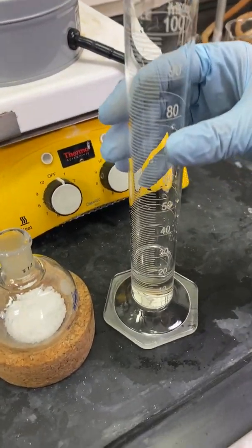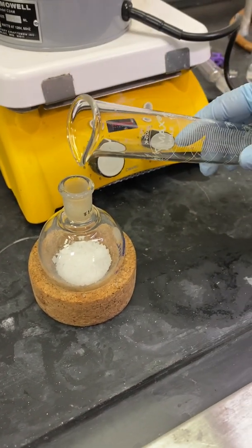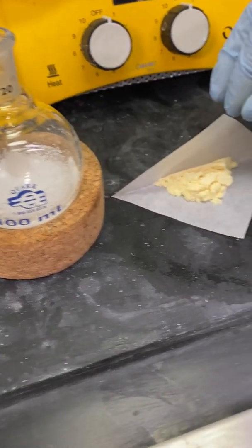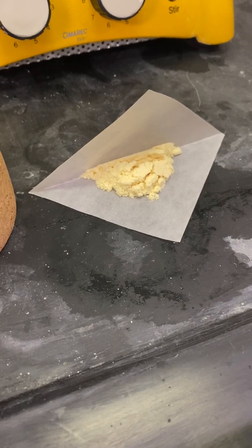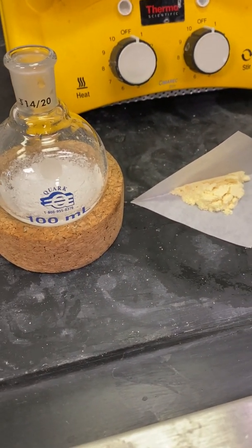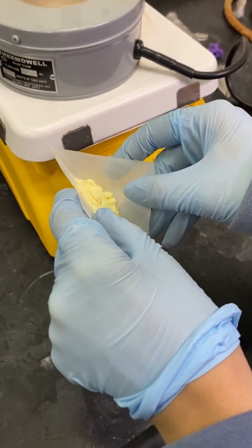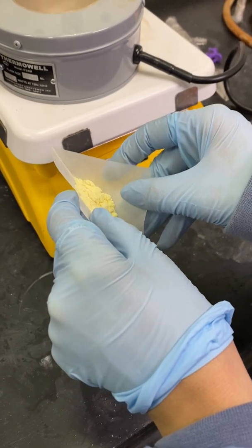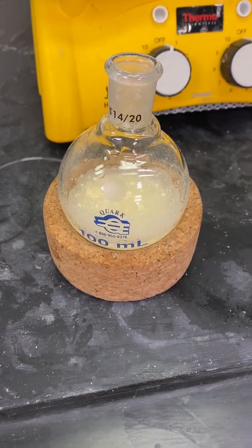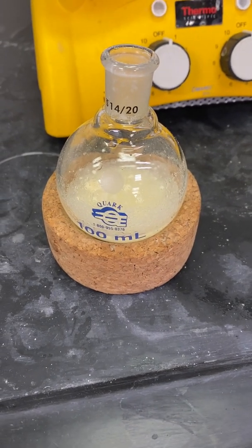I will now proceed to carefully pour in the amount of p-nitrobenzaldehyde into my round bottom flask. This is what my round bottom flask looks like after I've added in the p-nitrobenzaldehyde, containing my triphenyl phosphine and sodium bicarbonate.